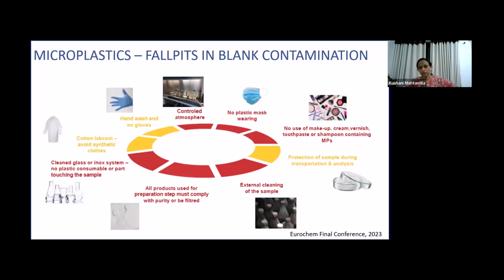The filter papers and the samples should be protected in glass containers or steel containers. If we are using bottles, it is recommended to do external cleaning before the sample is opened, so as to minimize the environmental contamination.